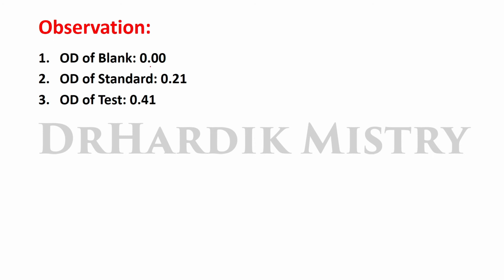Observation: OD of blank 0.00, OD of standard 0.21, OD of test 0.41.